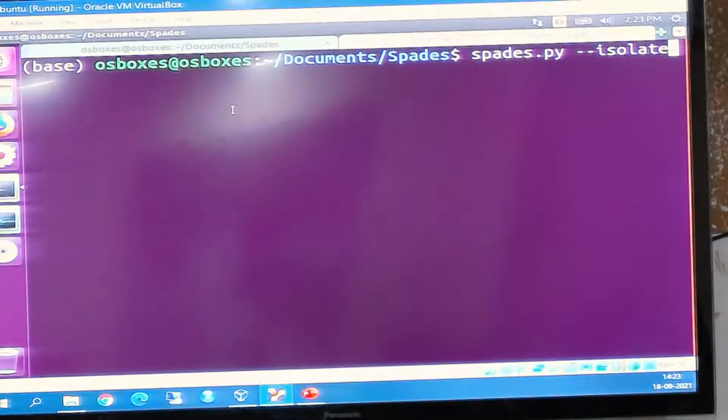So this is basically for bacterial genomes, mostly because bacterial genomes are of size less than almost 4 MB. So this is perfect for assembly; we use this for this organism. It is not suitable for other large genomes. This is why it is widely used for bacteria. You cannot use it for human, because the data it will give is not that way.